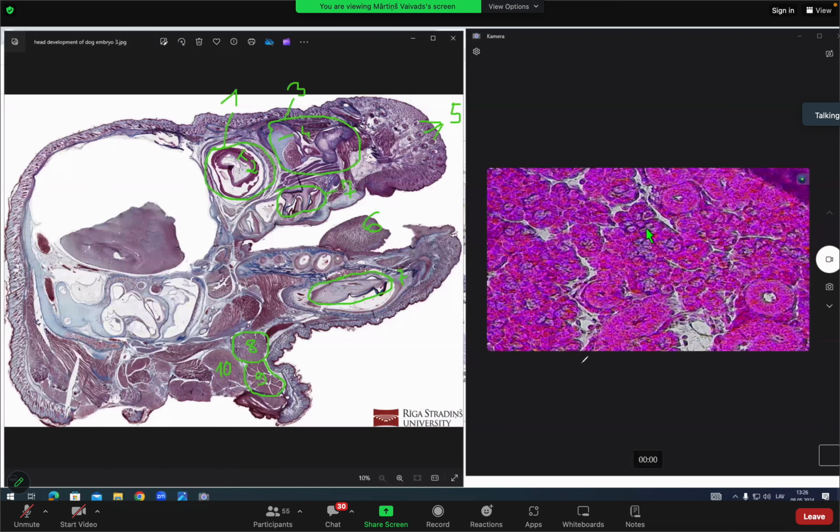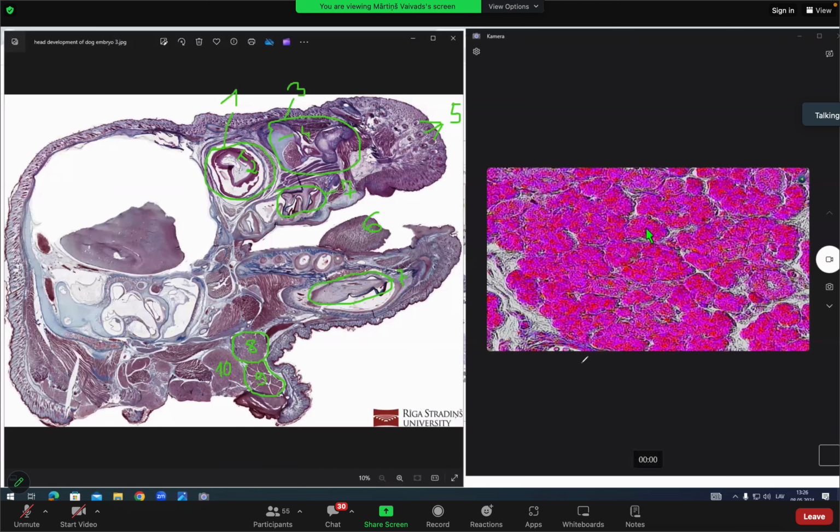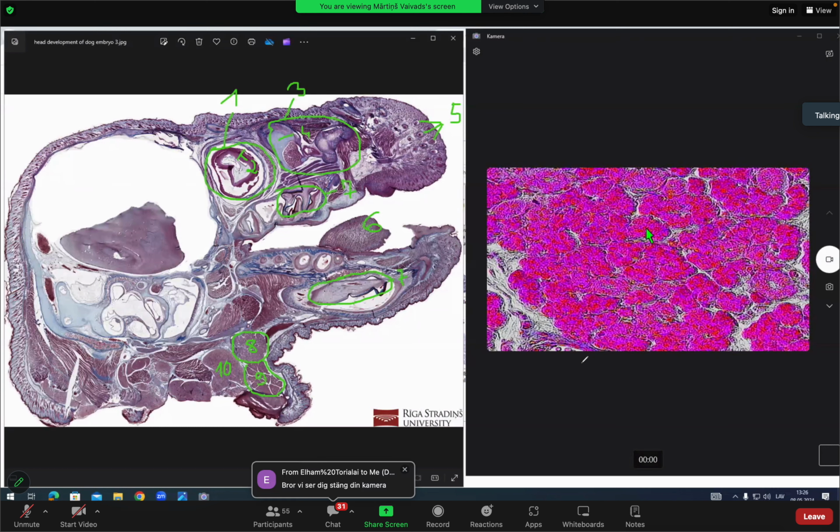If you zoom in on the submandibular gland, it has no mucus tubules yet. It's very dark staining. Submandibular gland is very basophilic. So it's very basophilic, no mucus tubules at all in the slide. Submandibular gland looks like this. And in many slides, it's the only gland. In rat slides, it's the only gland. If you have the rat's head, it's the only type of gland that you will see. But submandibular gland is very basophilic, no mucous tubules.